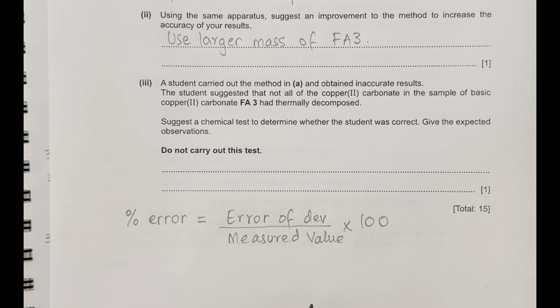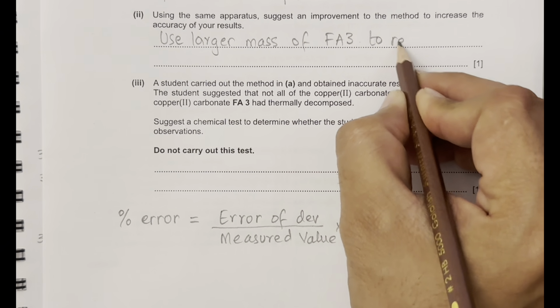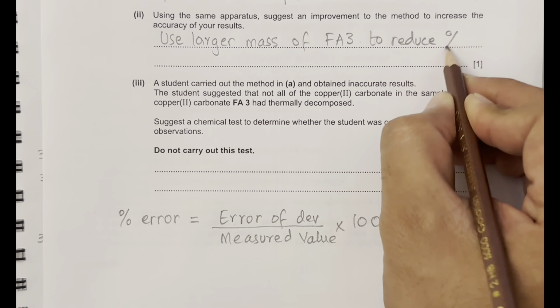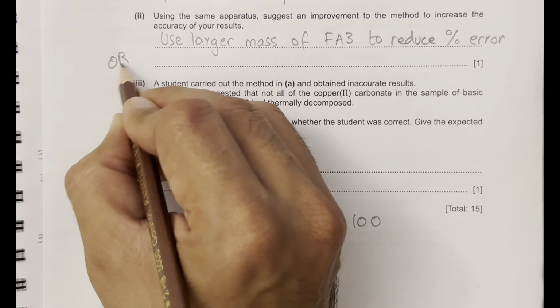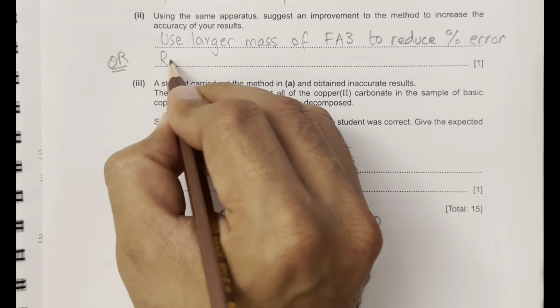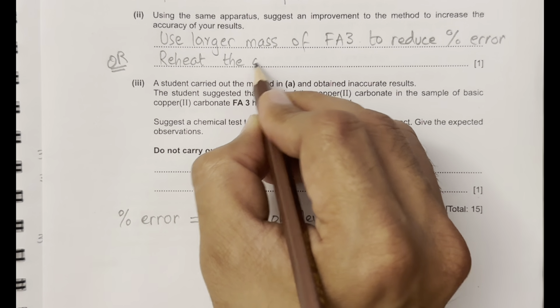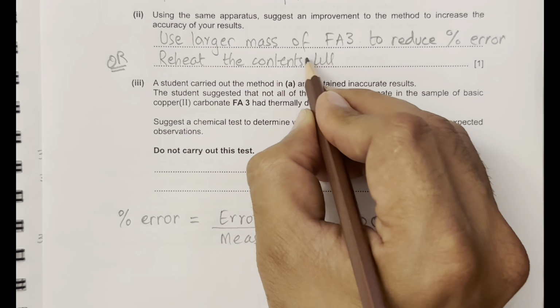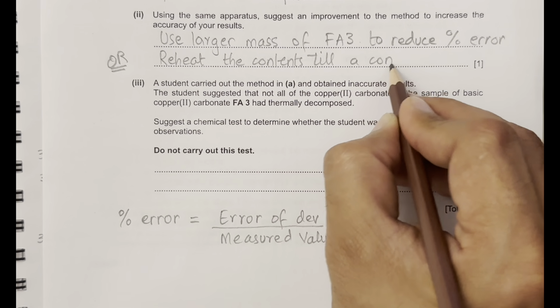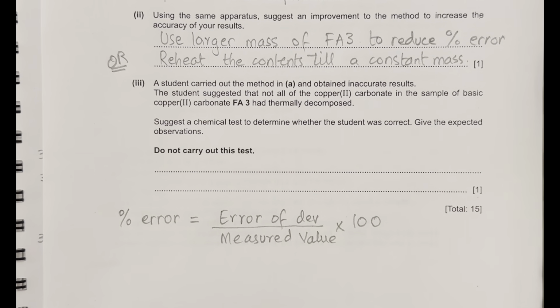Therefore, we can also say reheat the contents till constant mass, to reduce the percentage error. Just one you can write here.